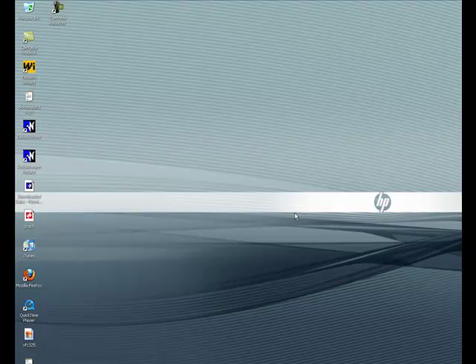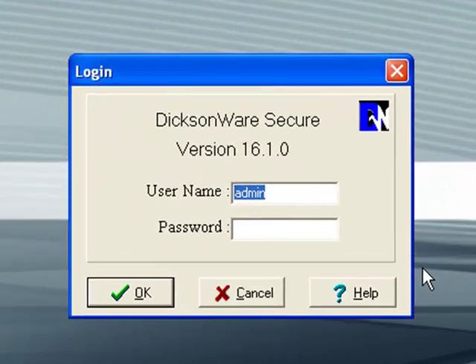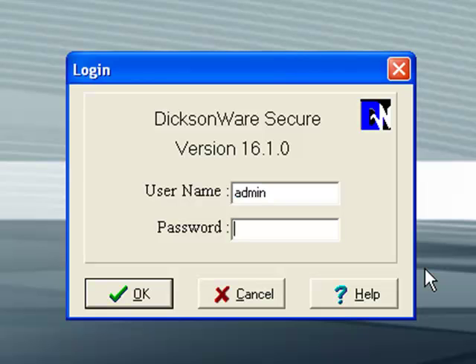First thing you need to do is to open up DicksonWare. Double-click on that. I'm using the secure version, so I have my username and my password.